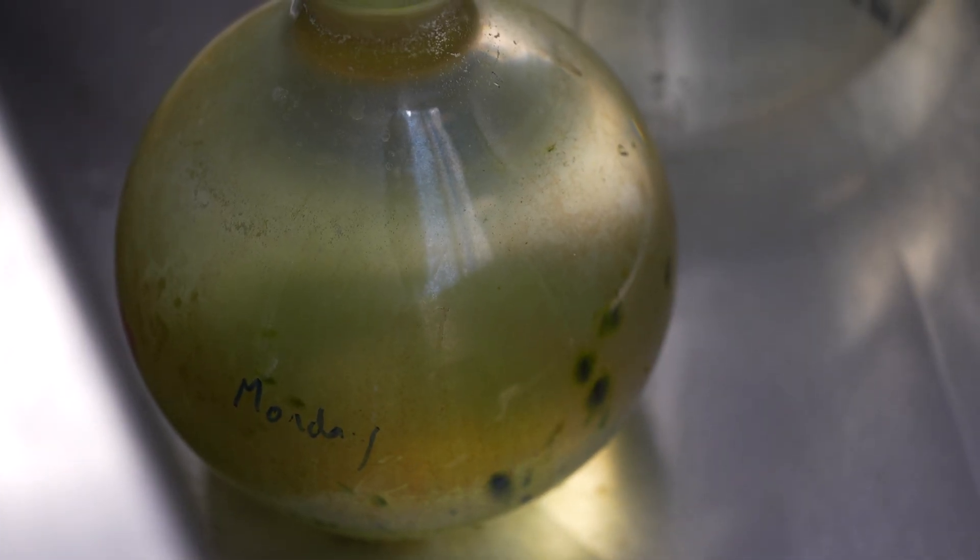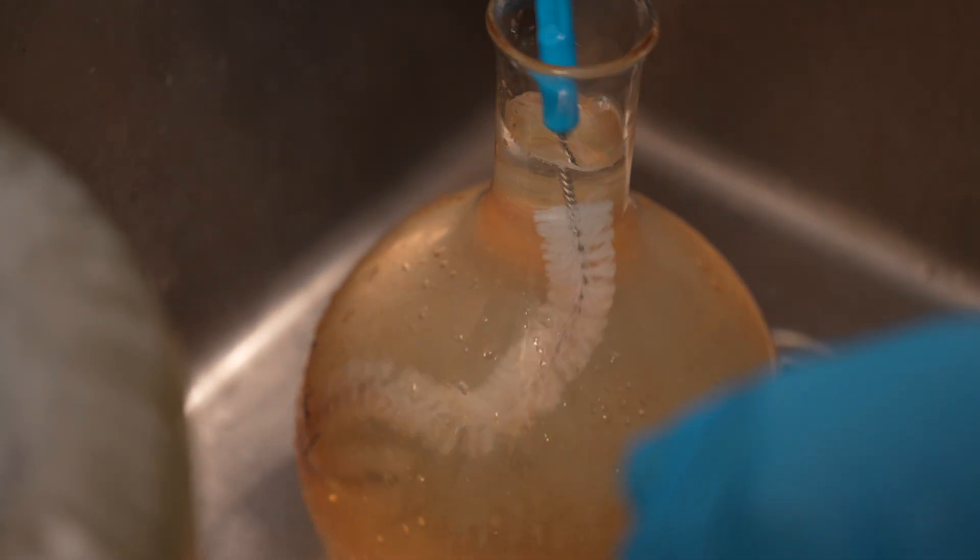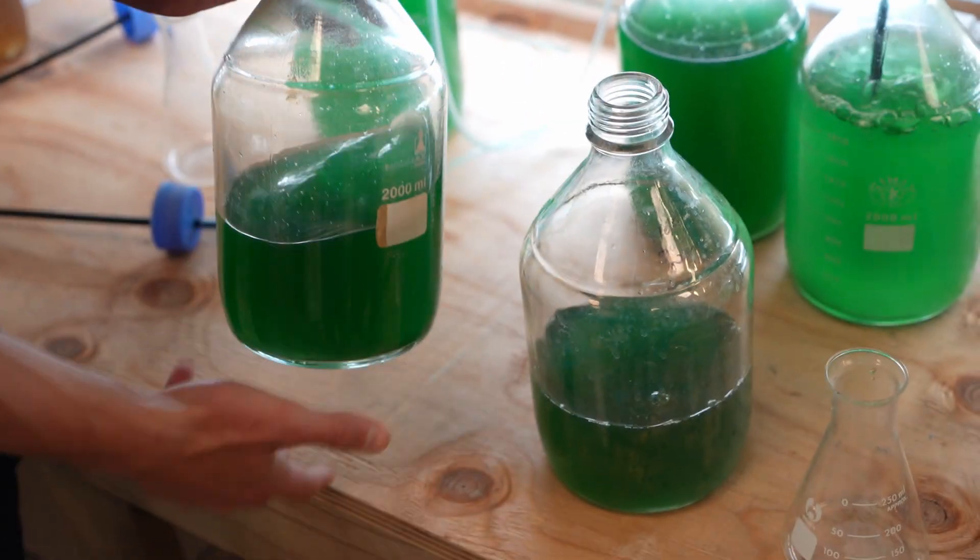And then we can actually crash that as well, which means emptying it out, cleaning and completely sterilizing the container. So there's no contaminants in it anymore. And then restarting that culture with a previously running strain of algae.